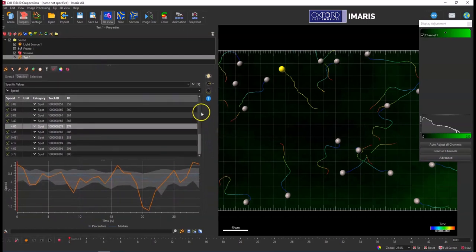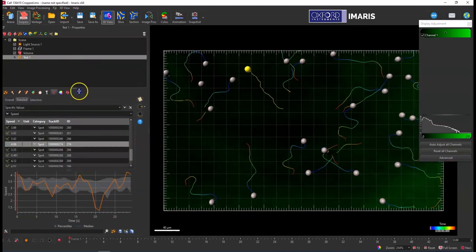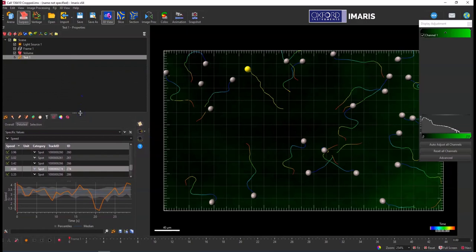you can really expand these menus by pulling the 3 gray dots on either the top or the side of the panels and making this as large as you want, and then using the snipping tool to snip that out and then use it wherever you would like. Or you can use Vantage to make something that will look really, really similar. It might not be exactly the same, but I think it'll get you close.